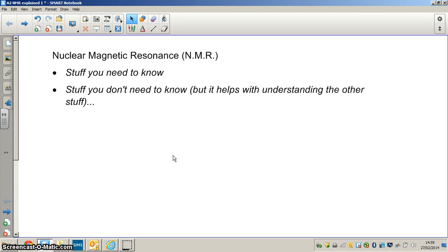In this how-to video I'm going to explain the basic principles of nuclear magnetic resonance, and I'm basically going to be talking about carbon NMR and hydrogen NMR. This introduction is really going to give you an overview of how it works. I'm not going to go into any deep chemical ideas or principles or explanations. Just a basic overview of how the process of nuclear magnetic resonance works.